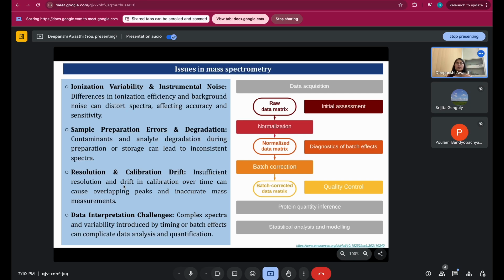We should not rush to perform the experiment quickly. First of all we have to think that proper separation needs to be done and a proper gradient has to be used, which could distinguish clearly between the different types of fragments, so that in the end we will be able to identify and distinguish among the spectra.